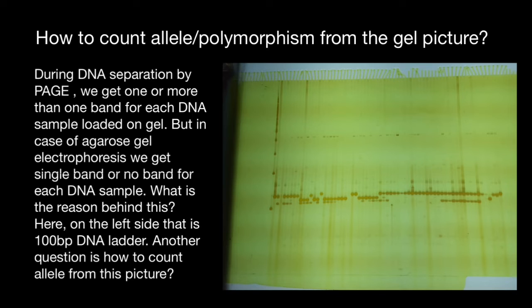We have a sequence, let's say A, T, C, G, A. So we can, of course, distinguish between 2 alleles of different size. For example, if we have an insertion here, another C here, we are going to get a new allele, which would be bigger by 1 nucleotide.